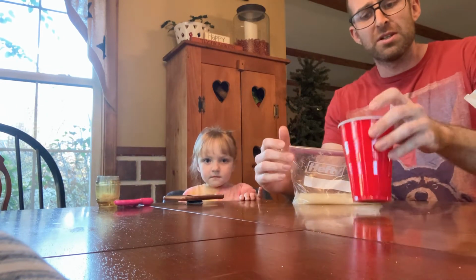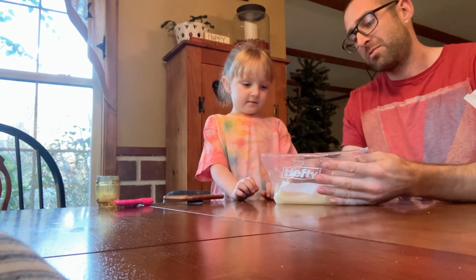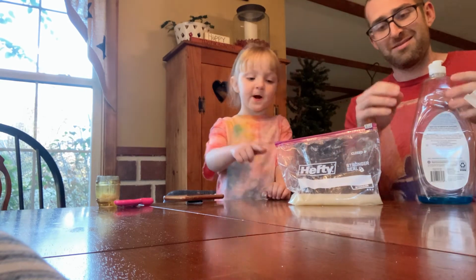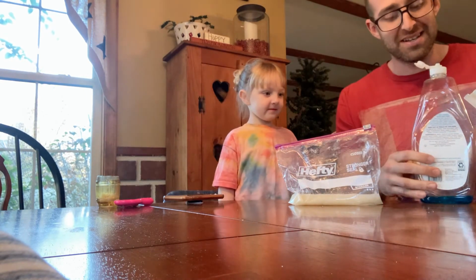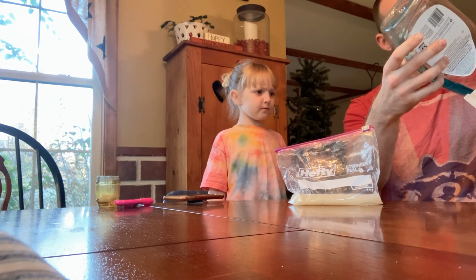Okay, Ems. So, we mushed up a banana in this bag. And then we added water to it to mush it even more. And now it looks like melted butter. It does look like melted butter. Now, is that soap? Yeah, now we're going to add some soap. We're going to add a teaspoon of soap.